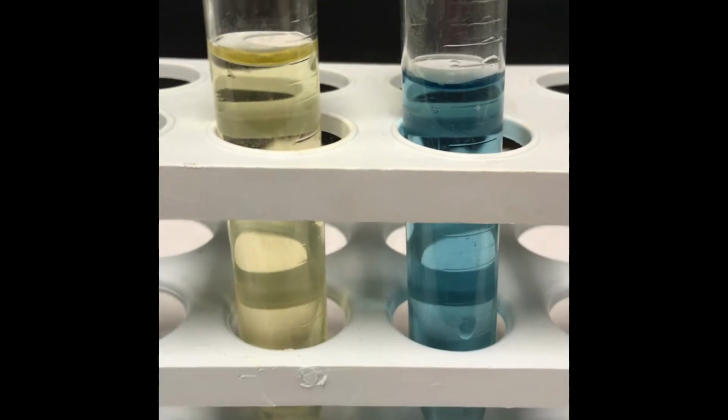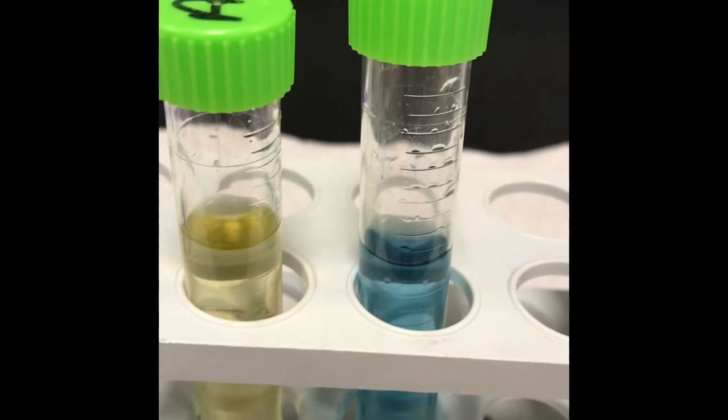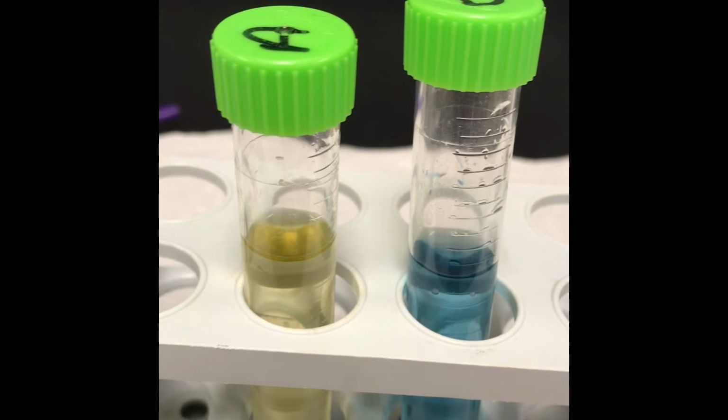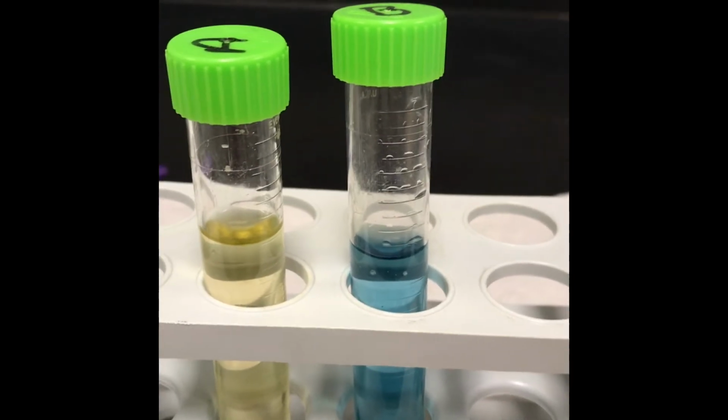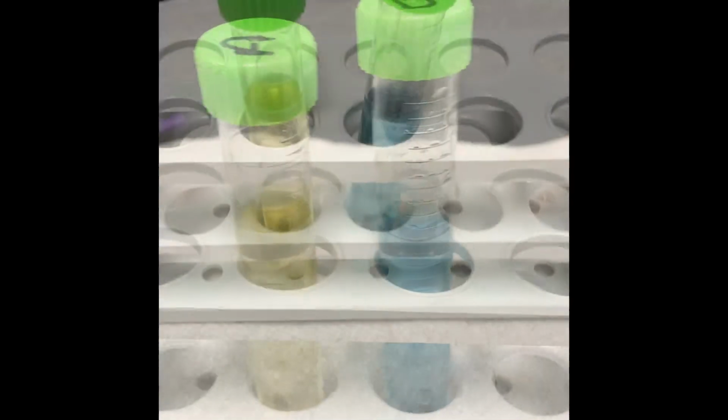Y'all need to note the color. It's beautiful, right? And then whether there's the presence of carbon dioxide or not. My tube B is still the same. Okay, so now we're ready for the next step, which is to add some specimens.